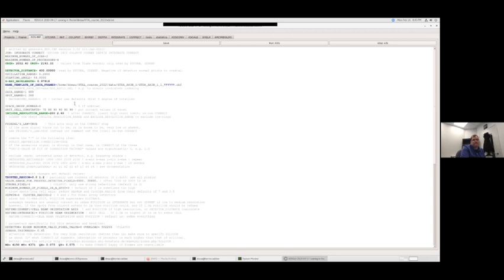Yes, Edwin, if you're changing resolution limits, you want to rerun integrate and correct. Because what's going to happen is it will change where your resolution shells are, and therefore that might affect your statistics.